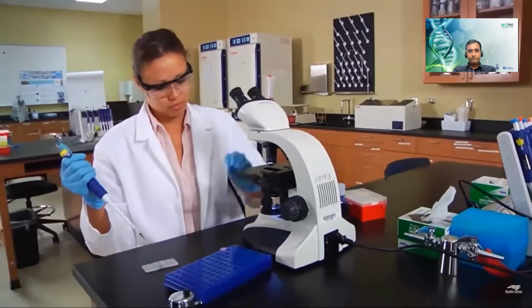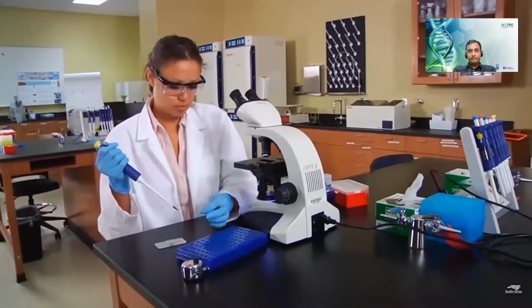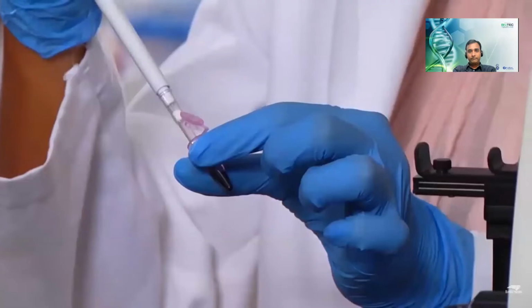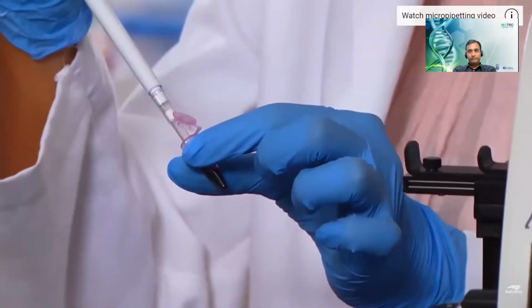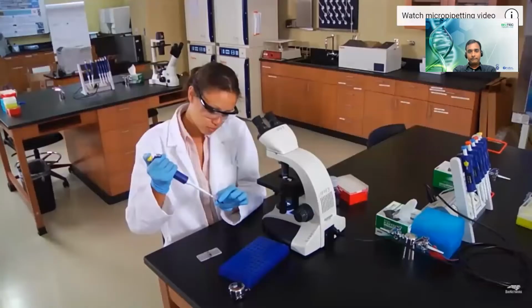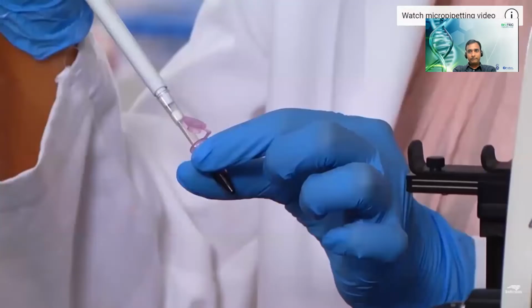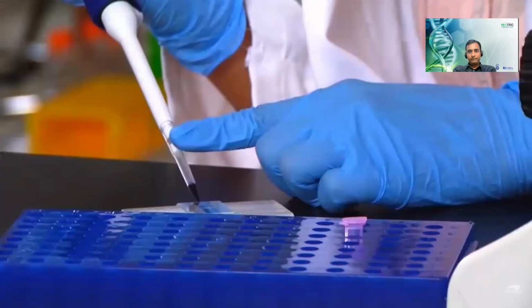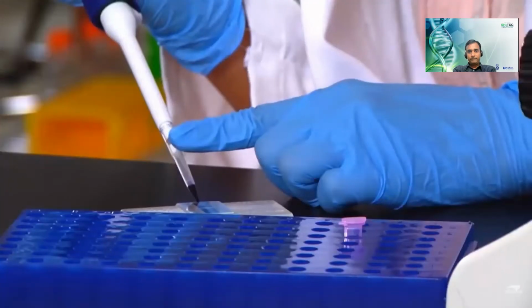Trypan blue is a dye that helps us distinguish between living and dead cells. The dye passes through the membranes of dead cells, so they will appear blue under a microscope. Living cells exclude it and will appear mostly clear. Load both chambers by pipetting the suspension under the cover slip.